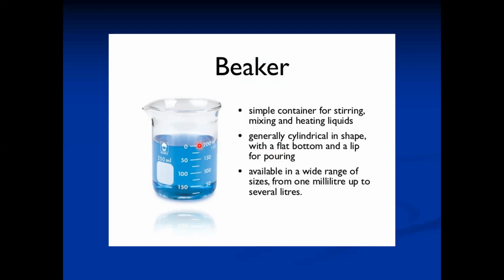Secondly, there is a marking on the wall of the beaker, so you can measure the amount of liquid by using the beaker. And then there are different sizes of the beaker. Very small beakers are available, and large size beakers are also available, which can contain up to several liters of any liquid.